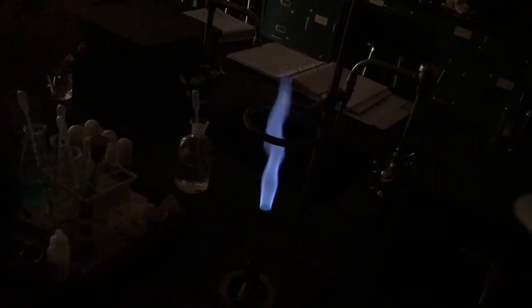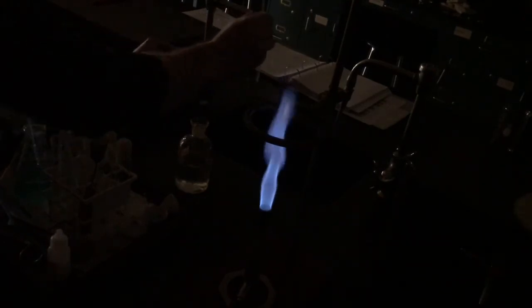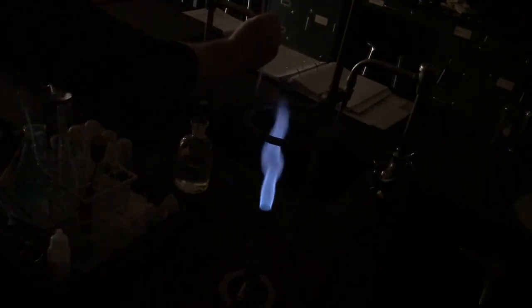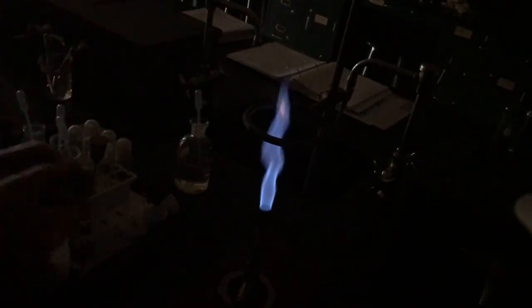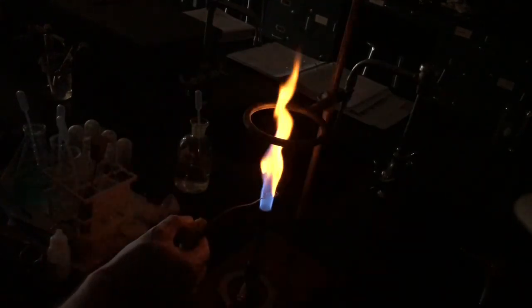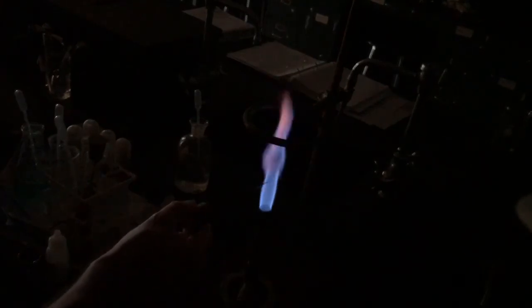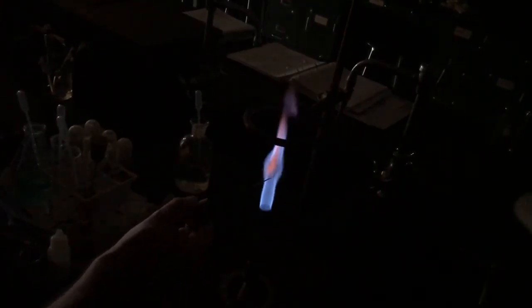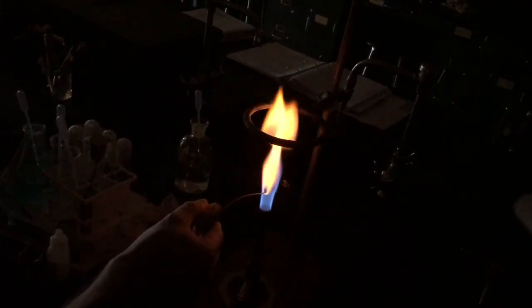Okay, so let's do our unknown. This is unknown number 24. So we know what the flame should look like if it's positive for a particular ion. Okay, so this looks like it's going to be the flame, bright orange. Let's see if I can get it. Bright orange for sodium. Okay, so it's going to be positive for sodium.